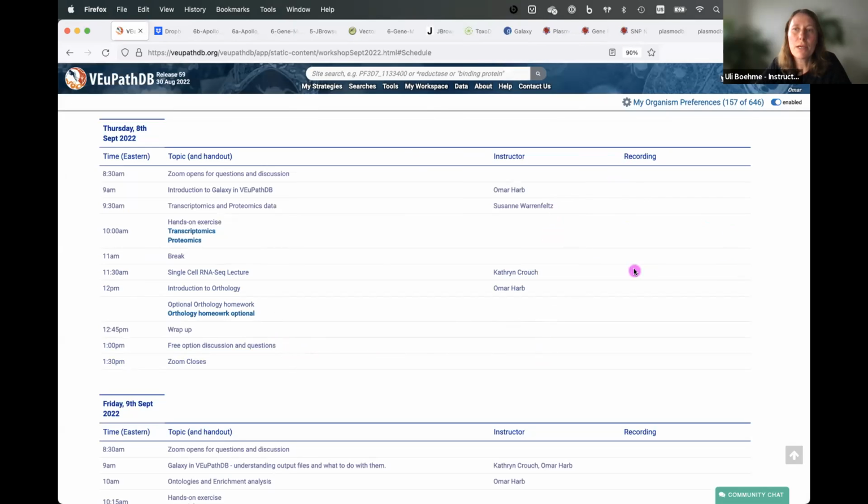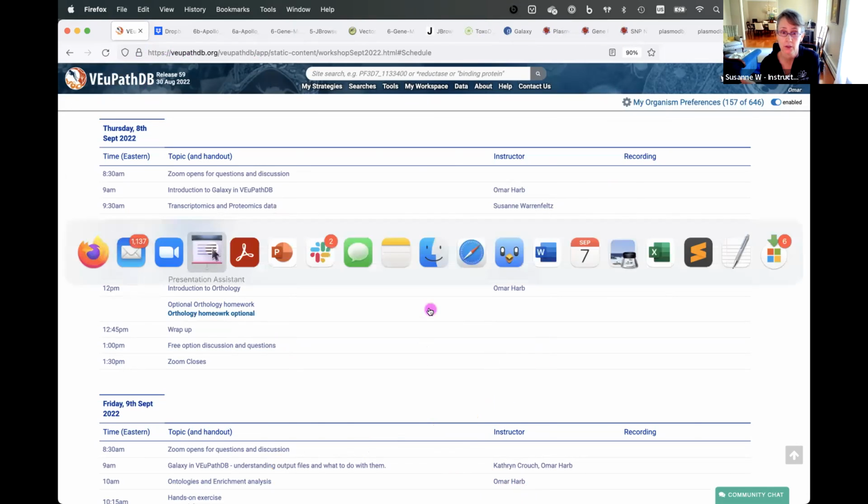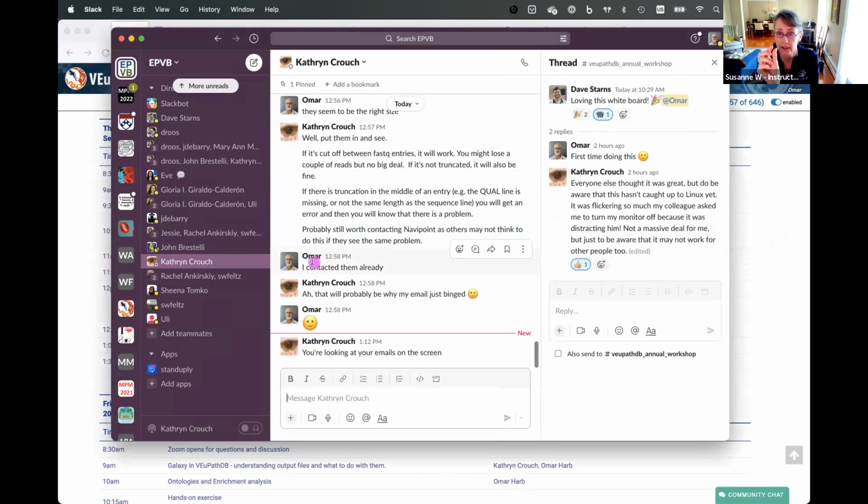Thanks for your question, Susan. Yeah, sure. It's an honest question. And I noticed on that last one that you did, it really did change that exon. I mean, it looked for the start site, the stop site. Your exon was only like, I don't know, 8 base pairs long or something like that, and you extended that UTR like, I don't know, 100 or something, and it chose half of that to go to the exon. Yeah, it was a good question.